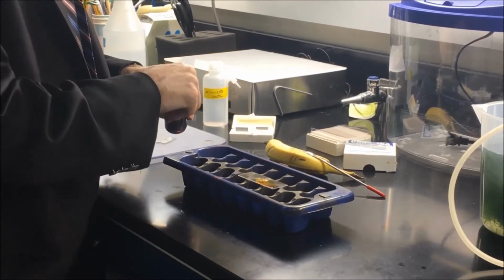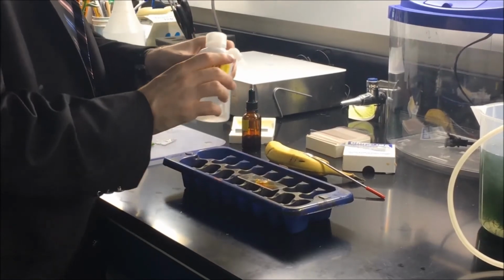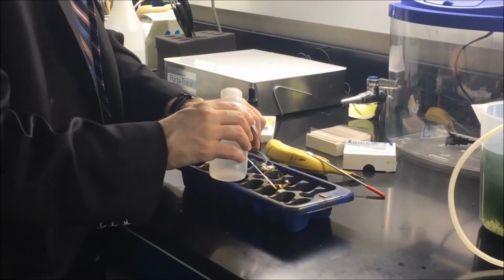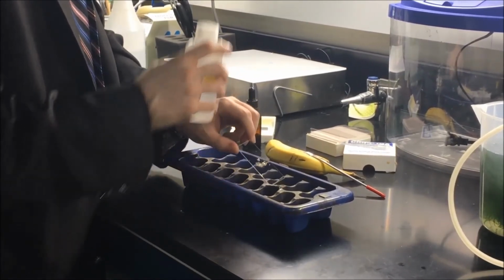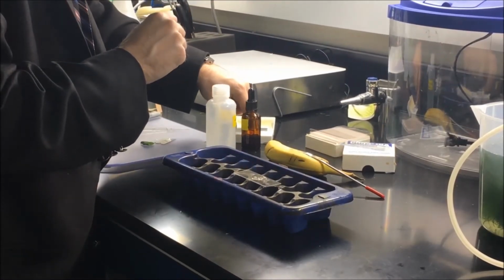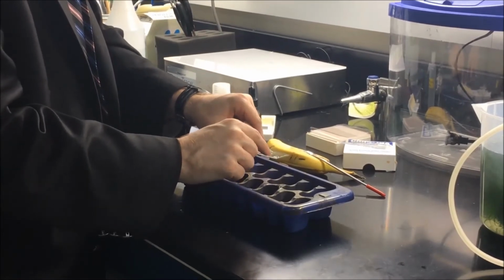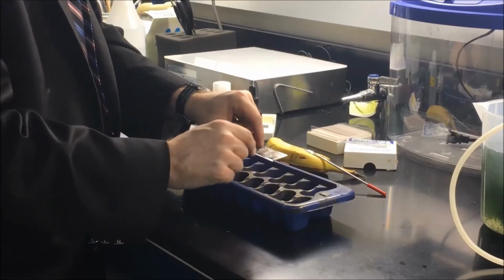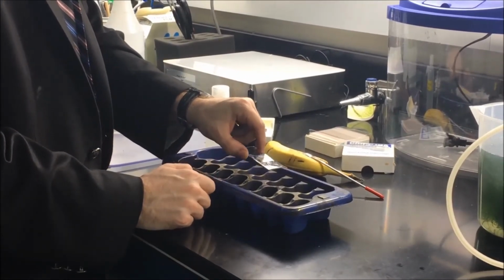Let that sit for a second. Take some deionized water and rinse gently. Tap off the excess. Take a cover slip, add it at an angle, drop, press gently, and then using the microscope we can look for starch granules.